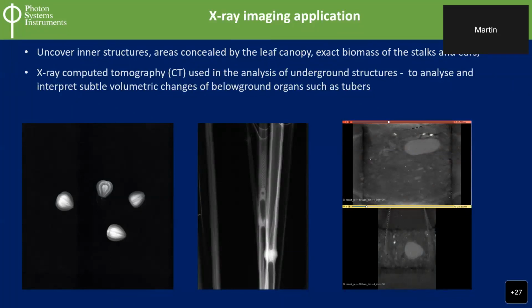the object. Right now, I would like to show you some results, some pictures. So X-ray, once again: if you go to the detector, you can see your bone. The same thing is true with plants, but of course there should be contrast in absorption between the part you would like to see and the rest. So there should be some contrast.